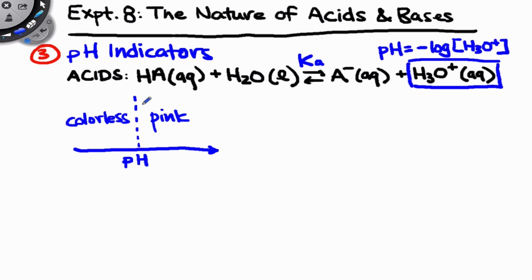In this experiment, you're going to be measuring this pH at which a color change occurs for phenolphthalein and one other indicator. But the purpose of doing this is not just to find out this number. The point of determining this pH is to come to a conclusion about the relative amounts of the weak acid form and the conjugate base form of the indicator when it changes color. So what I don't think I've mentioned yet is that an indicator is composed of a weak acid that is a different color from its conjugate base.